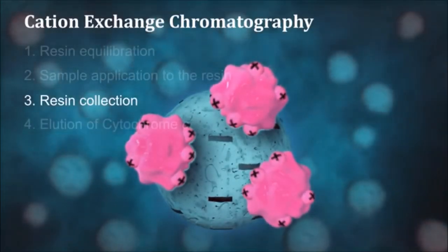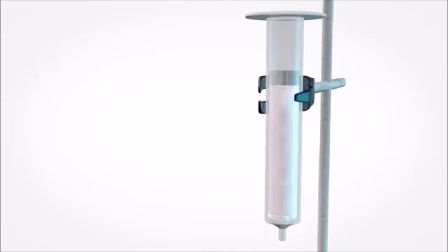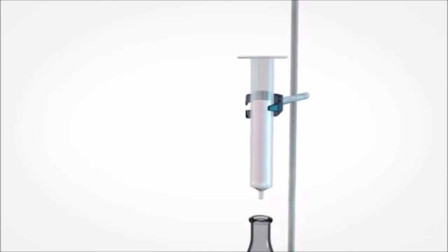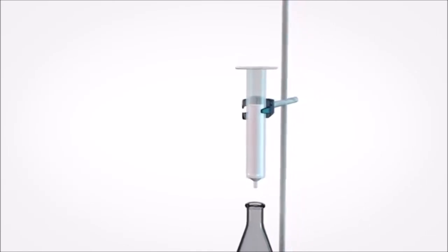Resin collection. The resin is collected into a syringe column and non-bound substances drain out of the column.